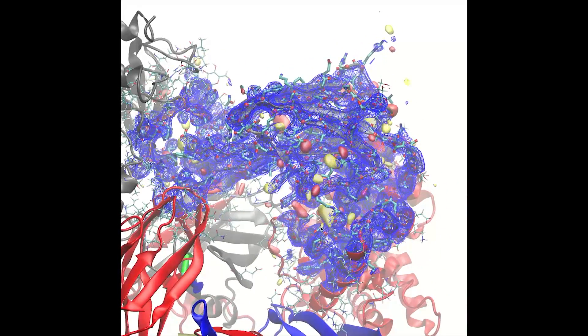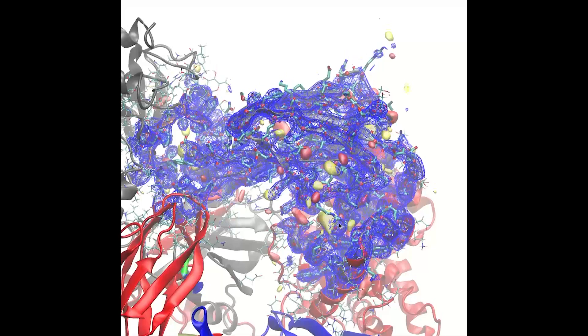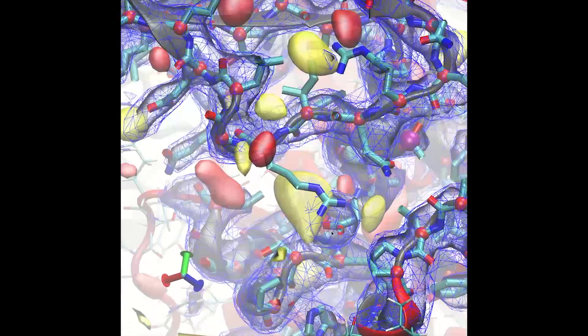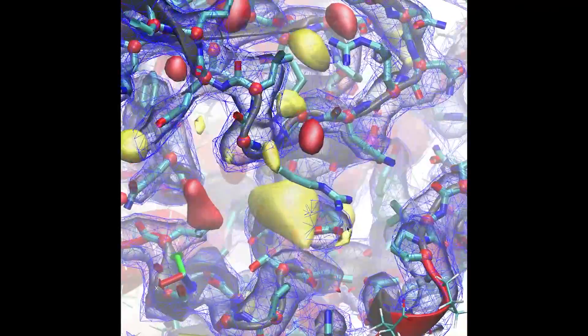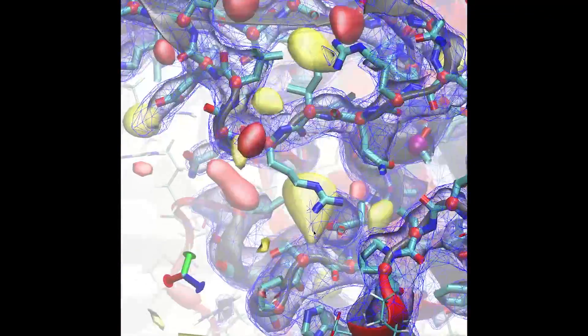I'm focusing on the CUB domain, where four beta strands are out of register. I'm starting from the original coordinates and maps generated after recalculating a simplified TLS only B-factor model.